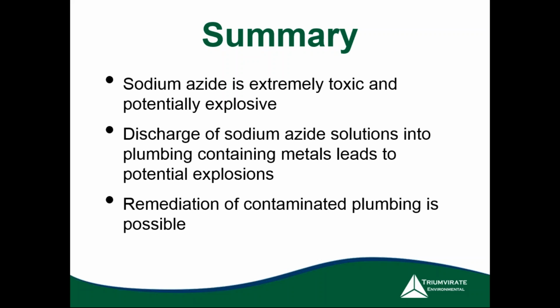Discharge of sodium azide solutions into plumbing containing metals leads to potential explosions. Any amount of this material, we've seen it happen at client sites, like I said, where the solution is only 0.01%. But over time, in those areas, this solution builds up and it leads to a definite potential hazard.